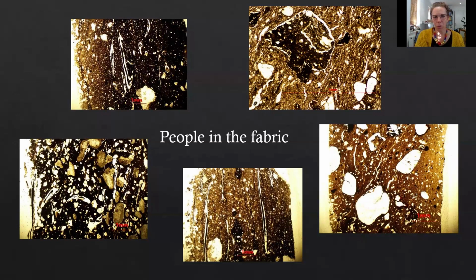So that's very useful. And right in the bottom in the middle, you've got wheel-produced pottery, and very helpfully the Saxon pottery has got grass temper or organic temper, and it's vertical, so the clay's been drawn up, and all the inclusions have gone straight up. So that's a really good indication of wheel-made pottery.